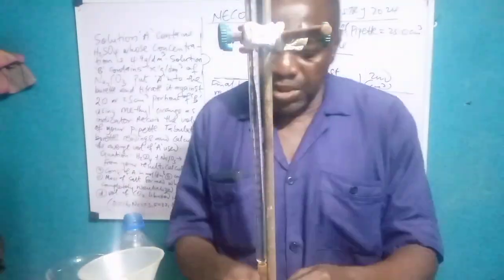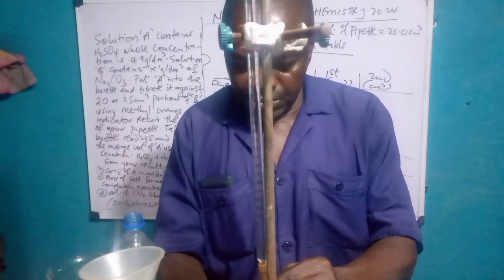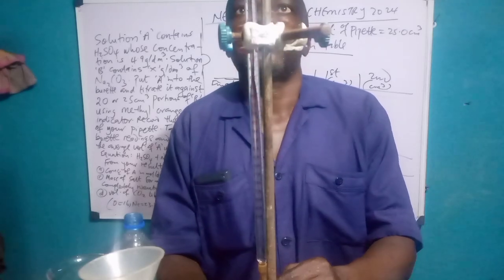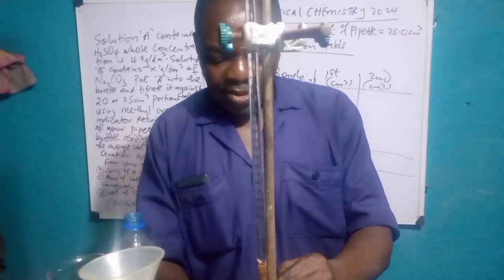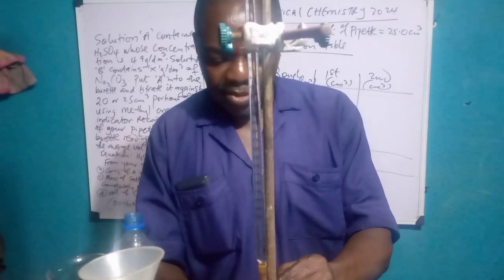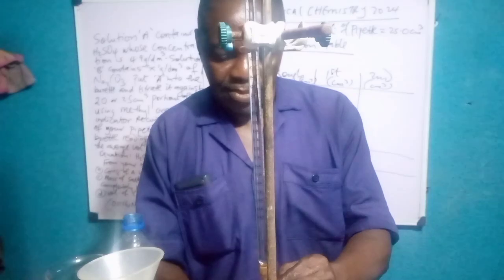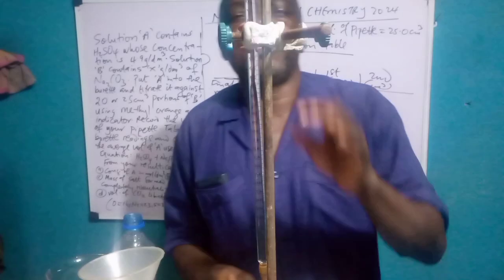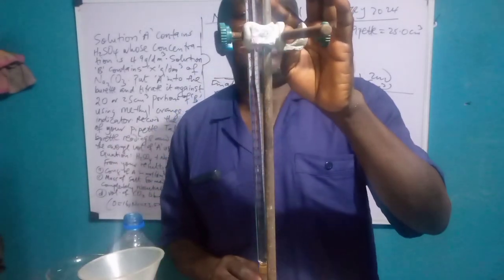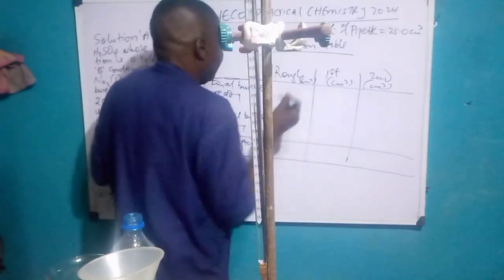You can see the color. I start my titration. I don't even need to look up till I produce a color change. Gradually changing. So you can see it's orange in color, orange. And the value I have here is 25.6, 25.60. I'll say rough.